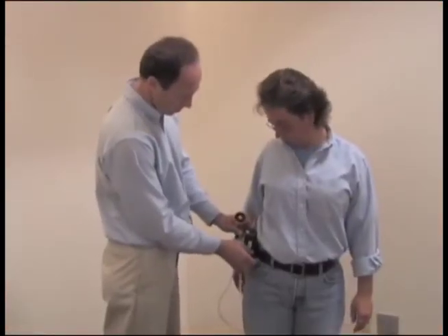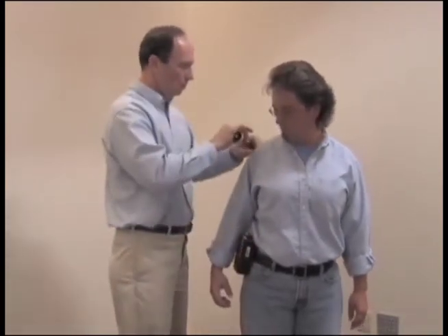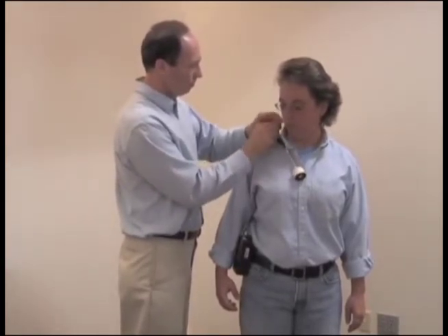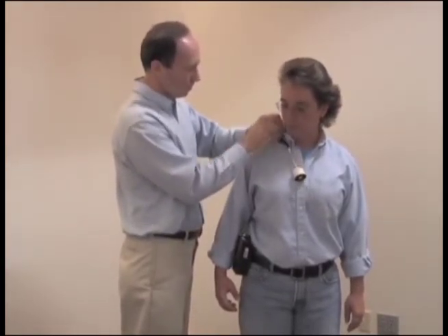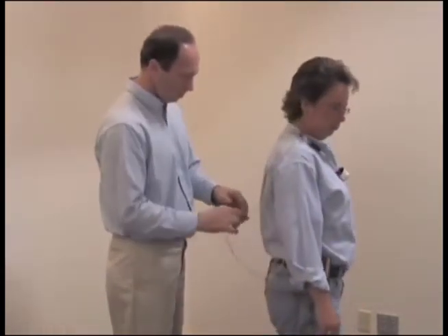Attach the pump to the worker's belt or pocket, either in the back or on the side. Bring the tubing around to the front. Attach the sample to the shirt collar in the breathing zone. Use the collar clip to attach the tubing in place along the shirt to restrict its movement.